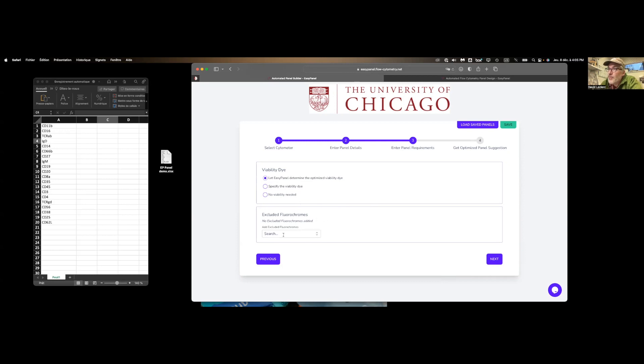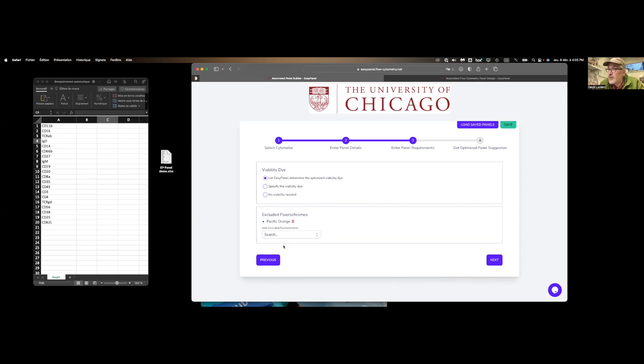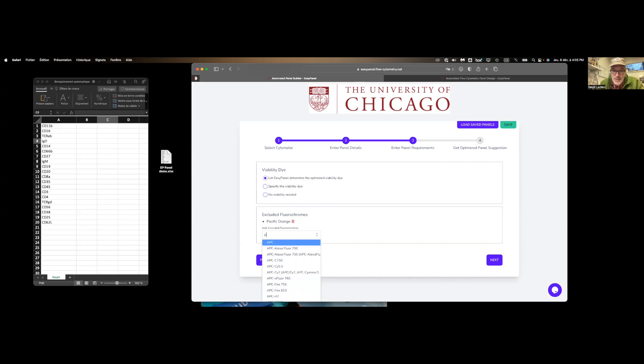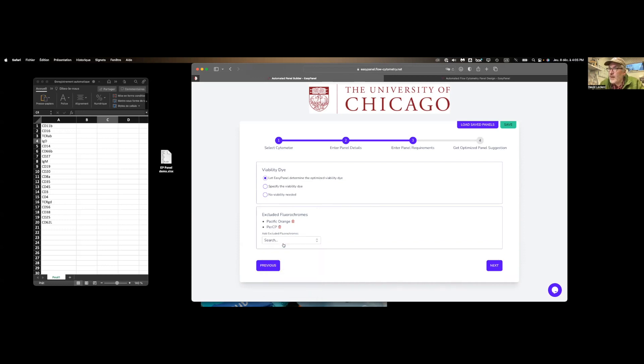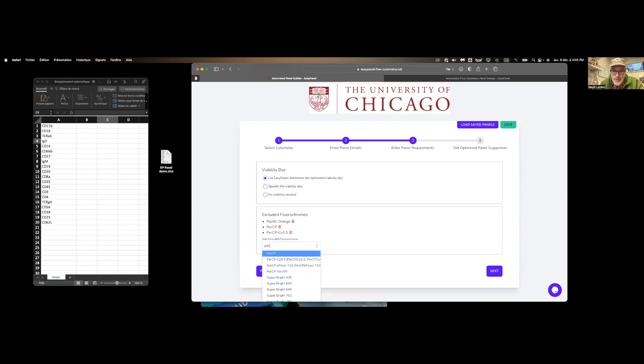Excluded fluorophores if you have markers you really don't like. So Pacific Orange, for example, you can enter that here. And basically the EasyPanel will not enter any of these fluorophores in your panel.